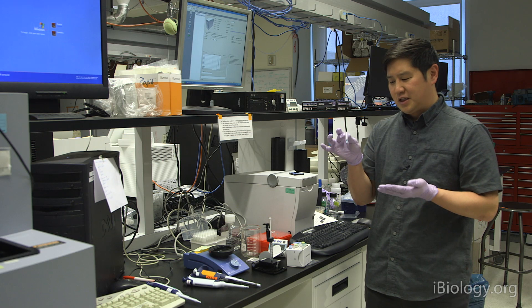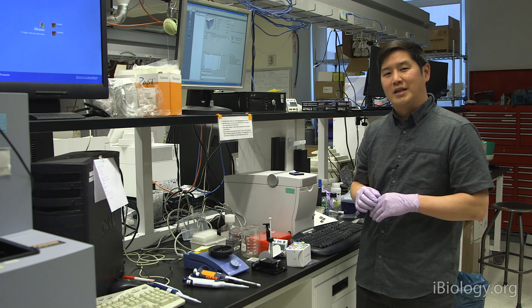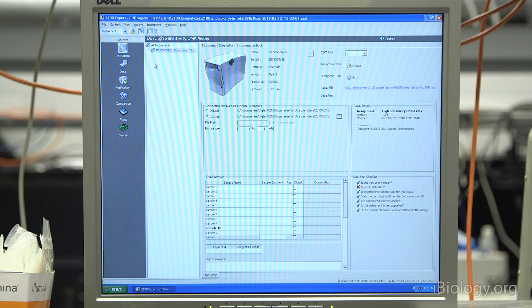What I have here is a tube of gel dye that we've already prepared. And this is what we'll be using today. But before we start preparing the chip, I'm going to demonstrate to you how to run the software.